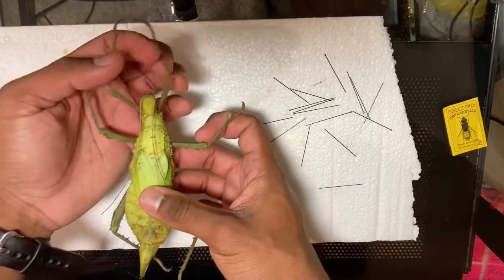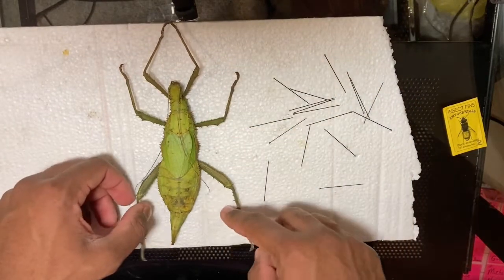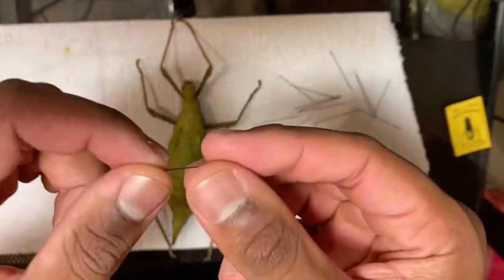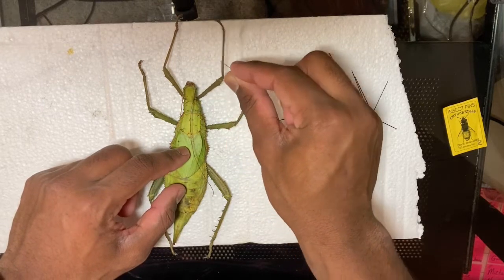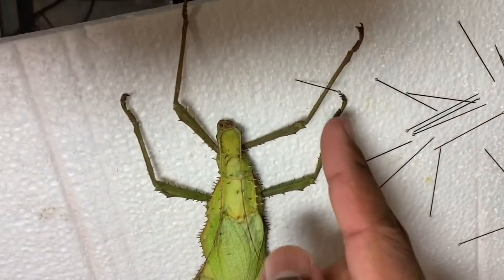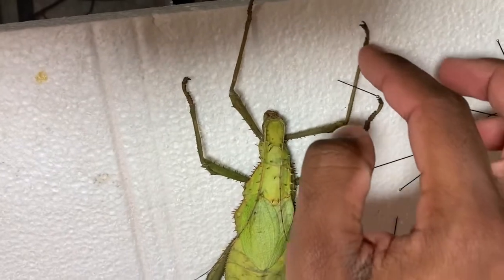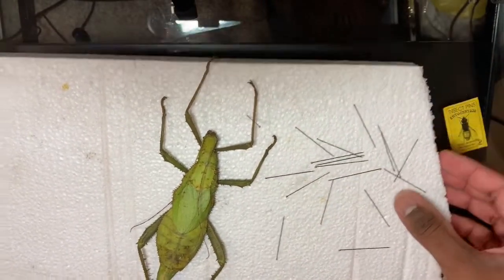I'm going to start pinning this Malaysian jungle nymph — I'll stretch out its legs and get it into position. I've actually never pinned this insect before, so this will be a first. What you're going to do is take your pin and, let's say with the foreleg, brush it against its body and put the pin right there so the leg is against the pin. Within a couple of days it should be all dried out — the body is going to dry and harden — and when you remove all the pins, the body will be in that exact position.